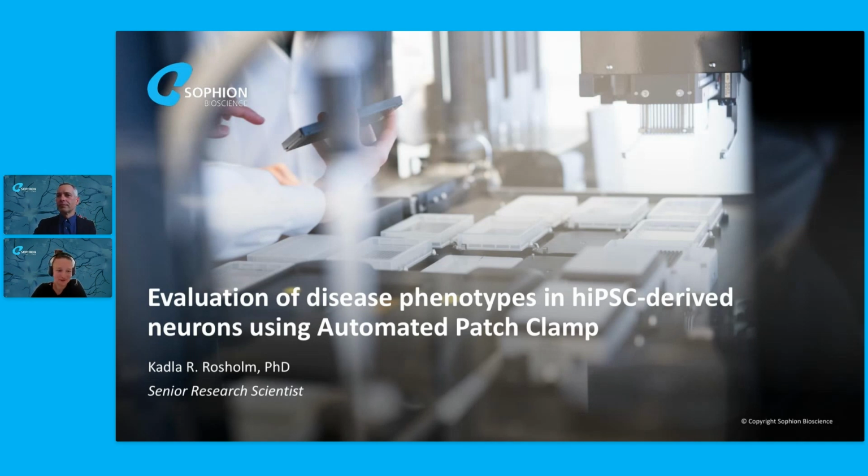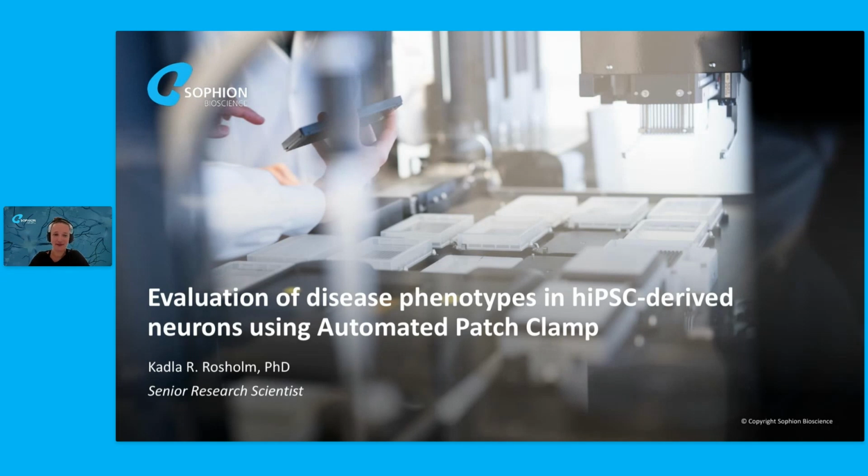Thank you so much, Damien. And I also had to run my presentation all the way to the back, but now it's ready. So I'm a scientist working at Sophion, and today I will present a project where we used automated patch clamp to evaluate disease phenotypes in iPSC-derived neurons.